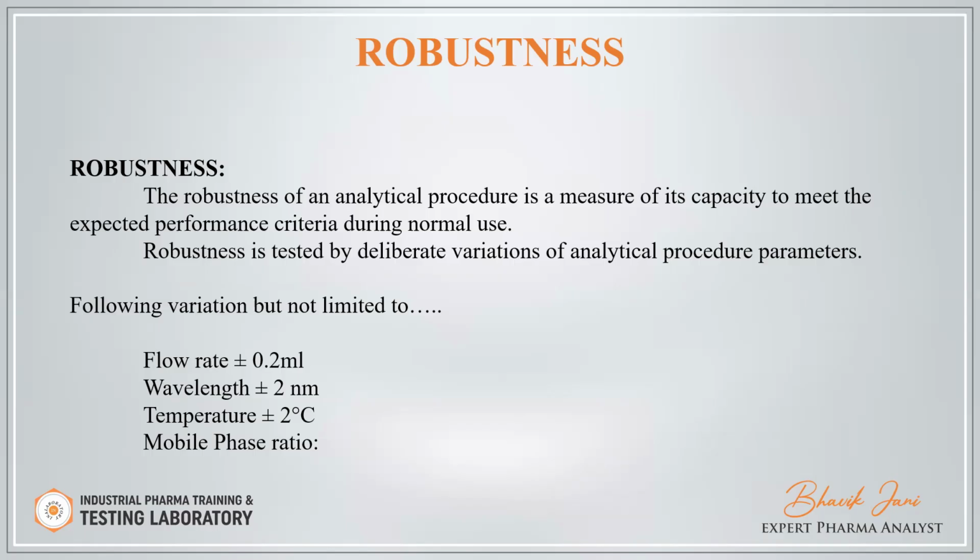And another thing, you can also perform the robustness by sonication. If your method gives 15 minutes, then you can use 12 minutes or 17 minutes. So you can experiment as per your experience and the product behavior.